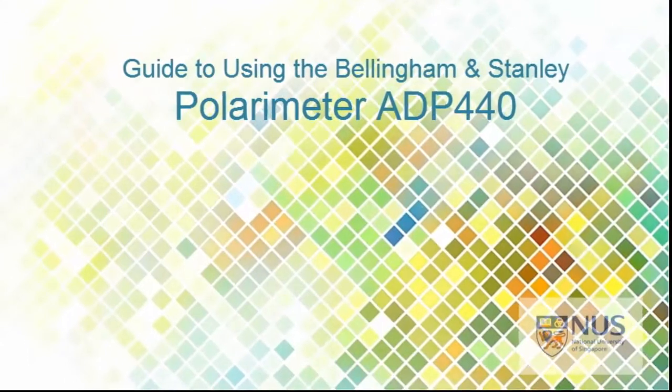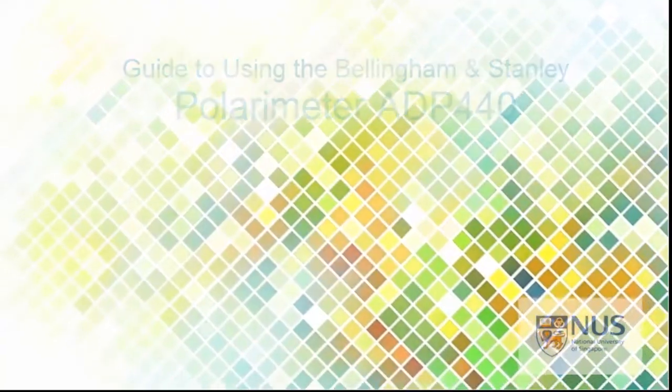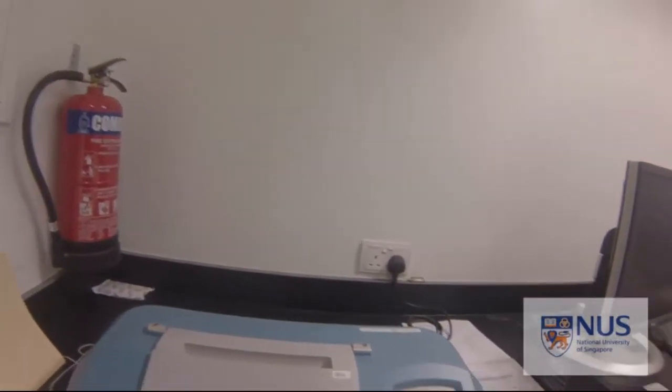I'll show you the basics of using the Bellingham and Stanley Limited Polarimeter ADP440. This polarimeter is normally found in S5 Level 4 in the instrument room opposite the synthesis lab. Okay, so this is the polarimeter.